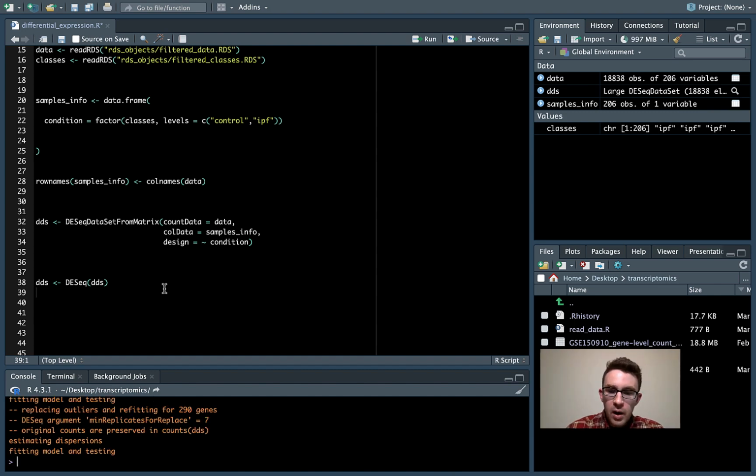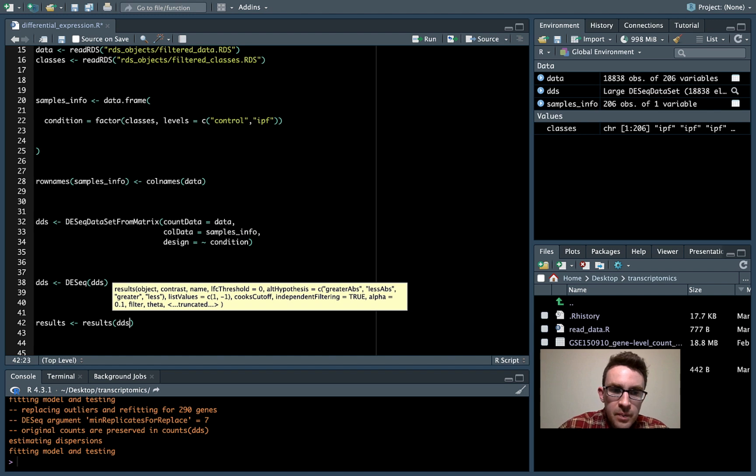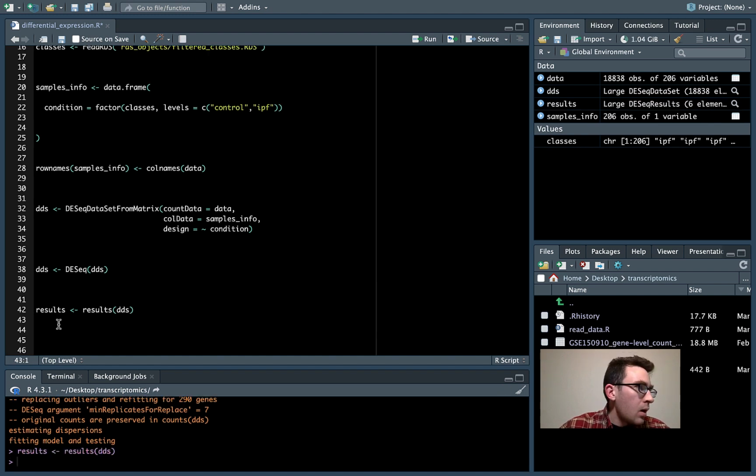Okay, so now the analysis is complete. Now we're going to pull the results out of here. So we're going to say results <- results(dds). Okay, so run that. And now we have these results we can look at. So let's take a look here. We can say head, because this is going to be a long thing. Let's just look at the top of it.